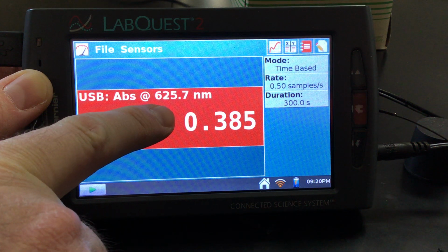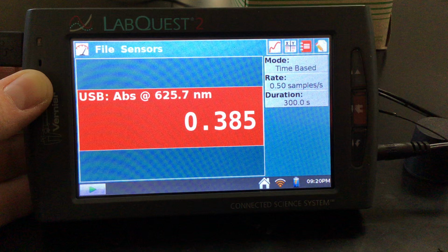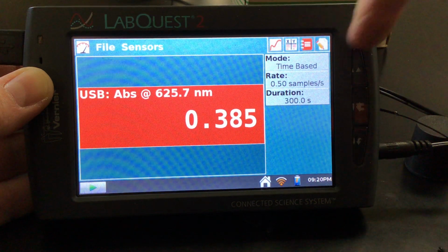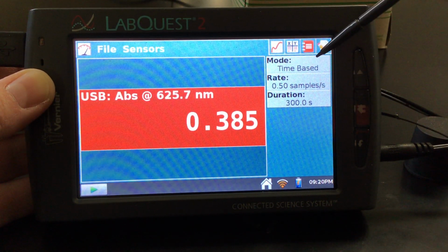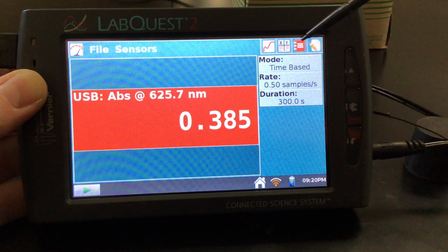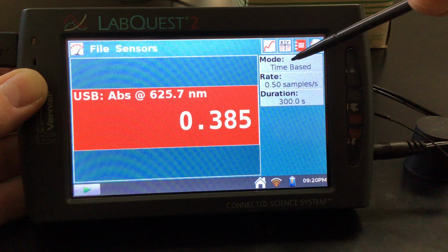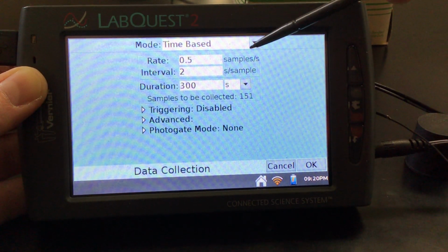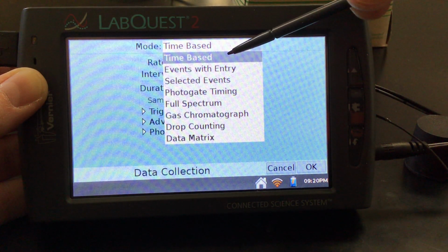As you can tell on our screen here, the peak wavelength that I came up with is around 625, 626 nanometers. And I did that in the full spectrum mode, the same as what we've done in the past. If I was to look at that again, I would change my mode, which is currently in time-based, to full spectrum. In order to change my mode, and just to double check my settings, I'll press the mode, and where we were in full spectrum.